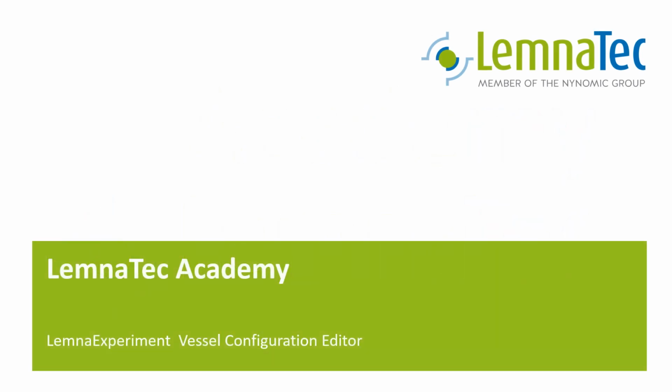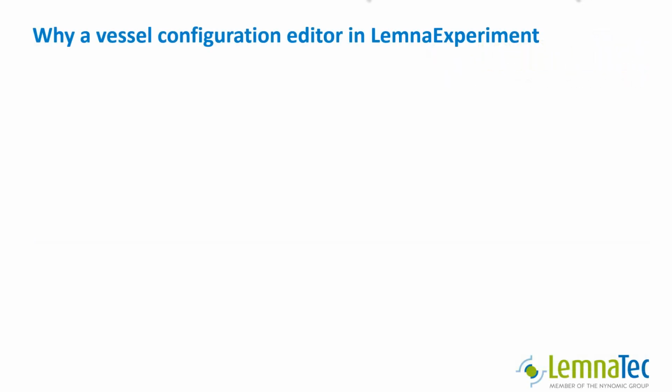In this video, we will have a look into the final major section of LemnaExperiment, the vessel configuration editor. But why do we need another vessel configuration editor if we already have one in LemnaGrid? There are a couple of scenarios where it can be helpful.